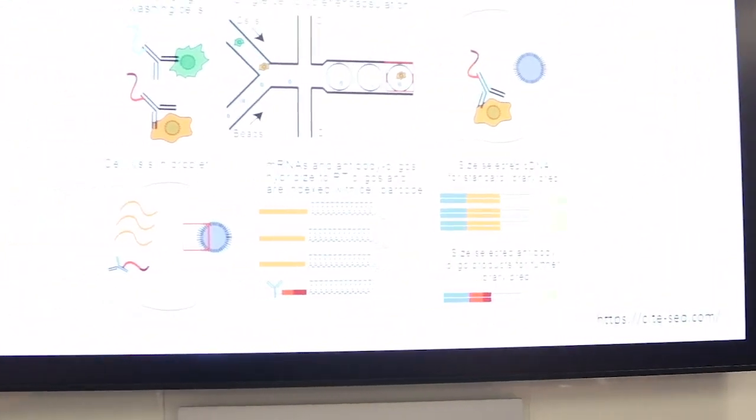I'm going to just go through fast. Some of the slides we've talked about already, but as Itai already mentioned, CITE-Seq allows you to look at the surface phenotype at the same time as the transcriptome using this specialized antibody that has a barcode conjugated to the antibody. Can I ask you a question? Yep. So, just technically, you just take your pool of antibodies, and you just throw them on the cells, you wash, and then you start the RNA-Seq. Exactly, yeah, so it's schematized right here actually.